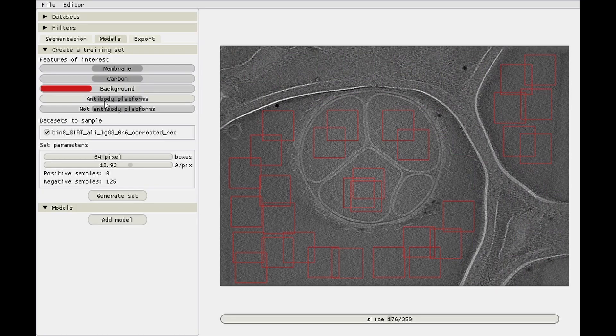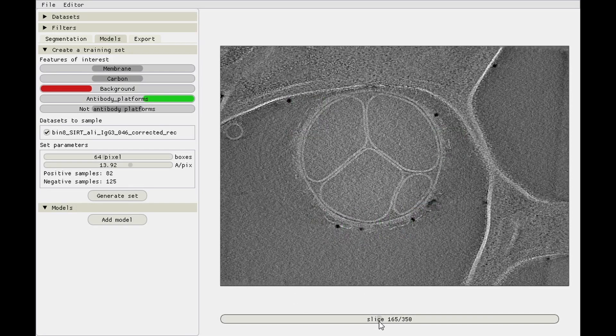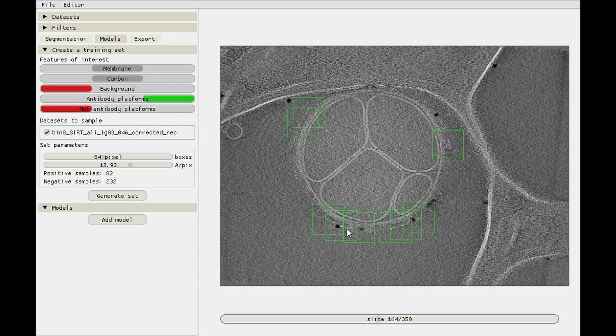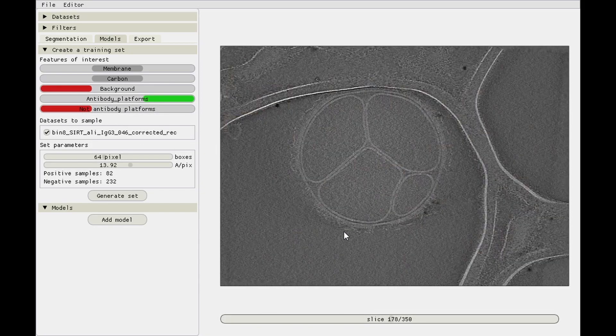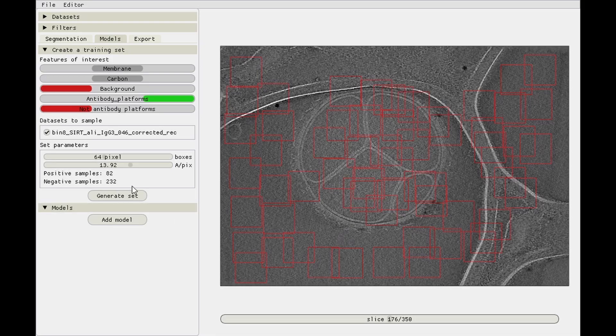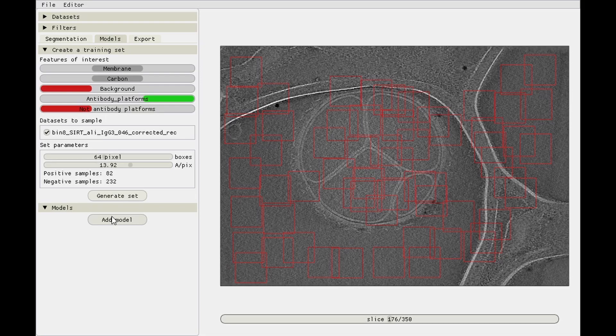And then finally, antibody platforms. We'll use background again, antibody platforms as the positive. See if we can actually find some of those, there we go, and then not antibody platforms as the negatives, which would be all of this. Generate set.